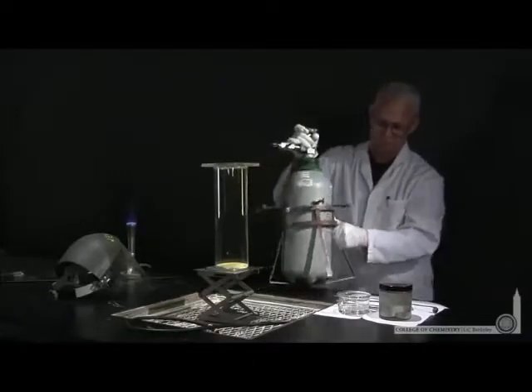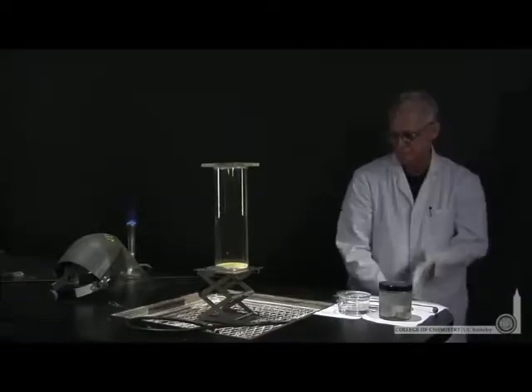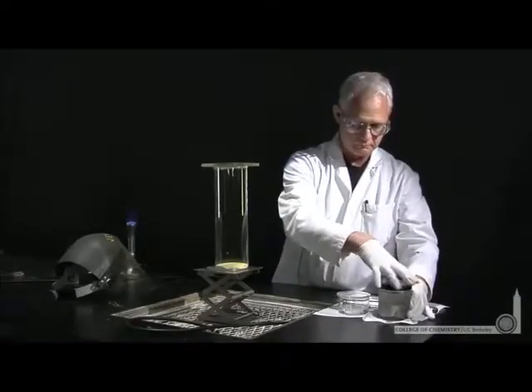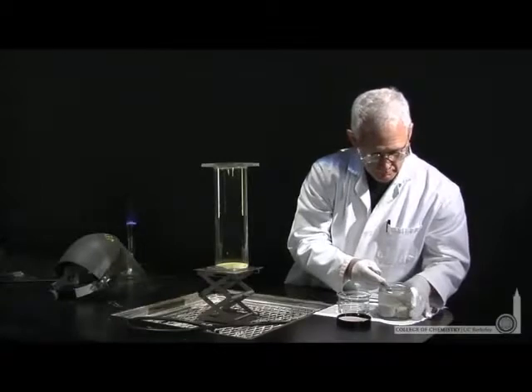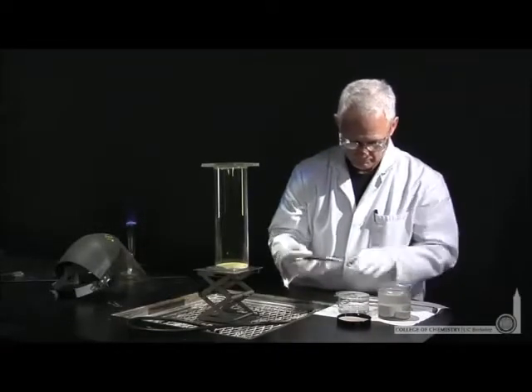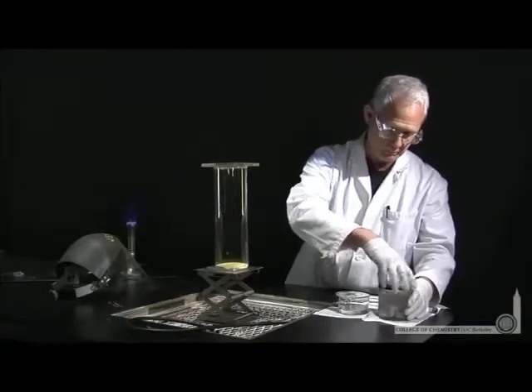Solid sodium metal is a shiny silver metal that's very soft. He can actually cut it with a knife. Sodium metal is very reactive. It will react in air and water, so it's stored under hexane. He'll pull off a small chunk and immediately store it under hexane while he prepares the rest of the experiment.